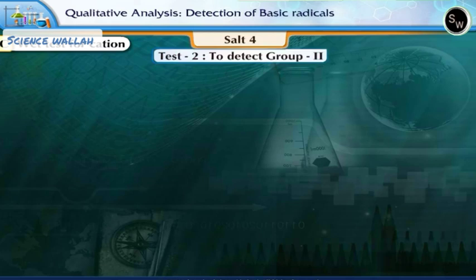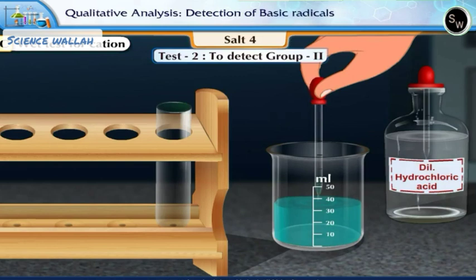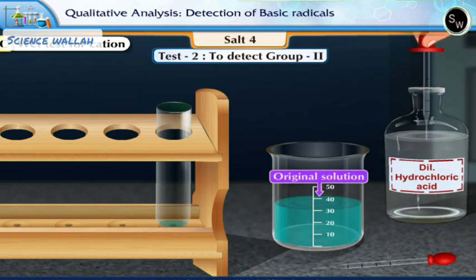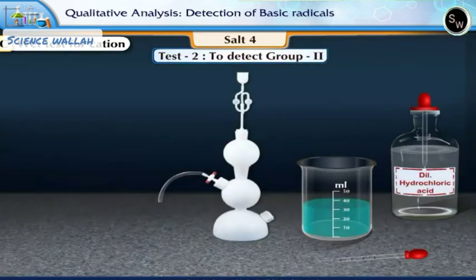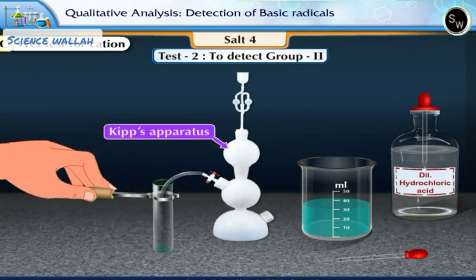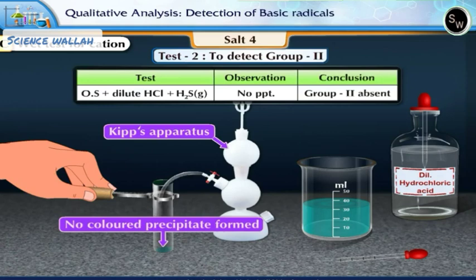Test 2: To detect group 2. Add about 3 to 4 drops of the original solution in a clean test tube. Add a few drops of dilute hydrochloric acid and warm the solution. Using Kipp's apparatus, pass hydrogen sulfide gas through the solution. There is no colored precipitate formed. This shows that group 2 is absent.